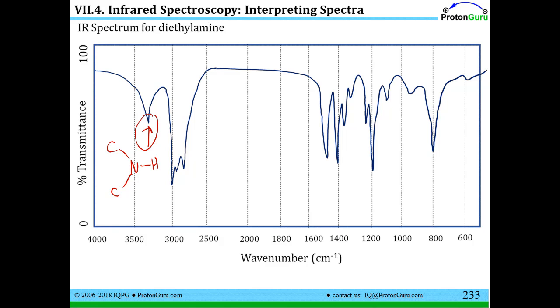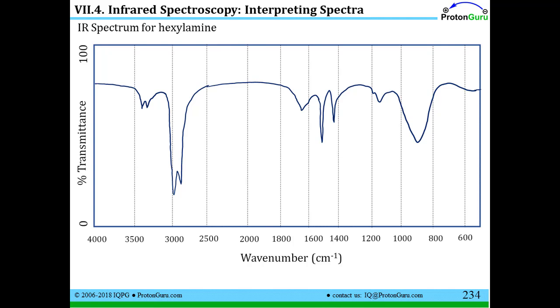In this particular case, this is a spectrum that I've sketched from a picture of a diethylamine spectrum. Diethylamine looks like this. We can't tell that these are ethyl groups necessarily just from IR data. We'll learn NMR a little later in the semester. But this gives us some information on what type of functional group might be here. Now, if you have some peak that's broad at its base with two little V's, or this W-shaped peak that we talk about, then each of those two little V's is probably an NH, and the N is attached to some type of R. This happens to be a hexylamine, which has a nitrogen with two H's, and 1, 2, 3, 4, 5, 6 carbons. That would be the structure.